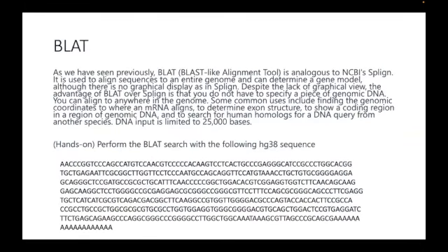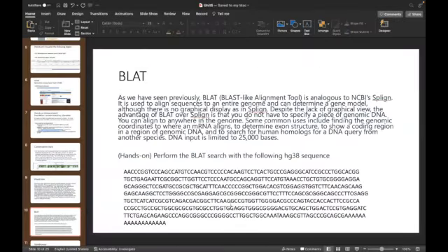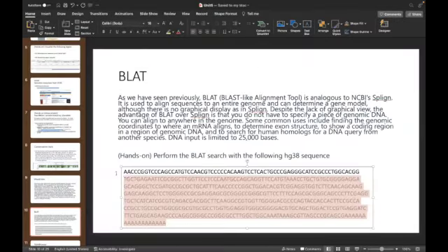Even though I don't put a lot of attention on those two, I want to do this exercise together. Is there anyone who used BLAT? No? Let's try to use it together. Do you guys have access to this page? Let's do it together. Can you highlight this thing, and Control C or Command C to copy.